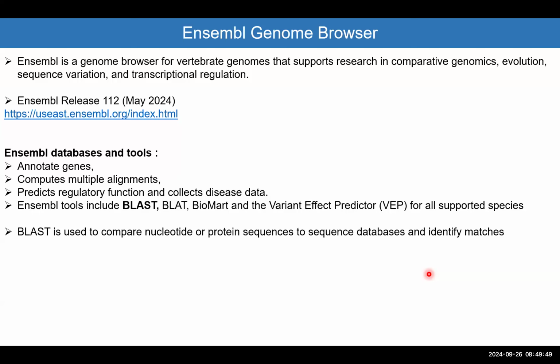For example, if you look at BLAST, and BLAST is the function, if you have a sequence of 10 or 15 nucleotides and you want to know where those 15, 20 nucleotides come from in the human genome, you can use BLAST. It will tell you that it belongs to this gene. It can be found in this gene. And there's a possibility that there's a similarity in the sequence to these 3 or 4 genes. So both browsers can give you this functionality.